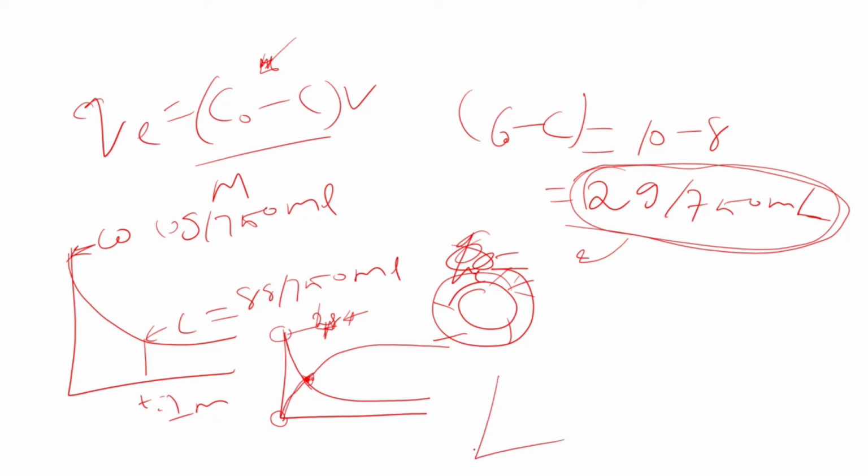So you are growing your solid at the expense of your liquid. That's the meaning of this. This number, 10 minus 8, says 2 grams, which means 2 grams moved from your liquid side to the solid side, so your crystals will be growing.